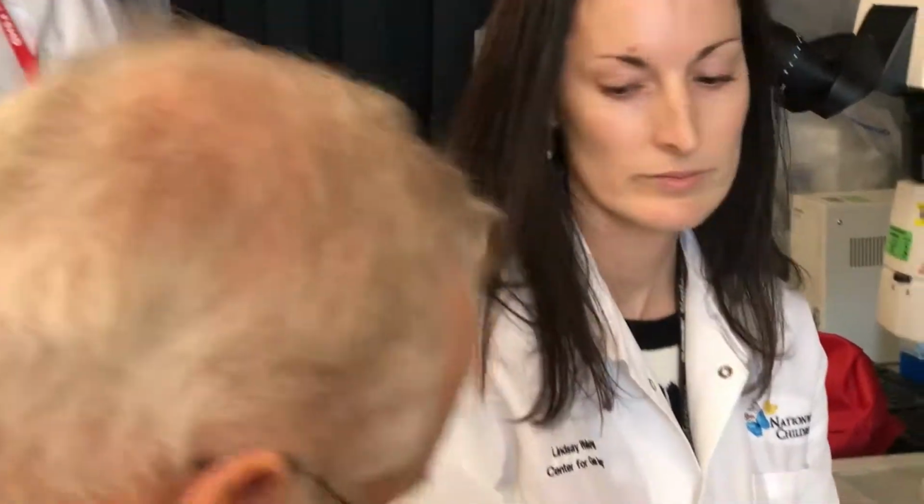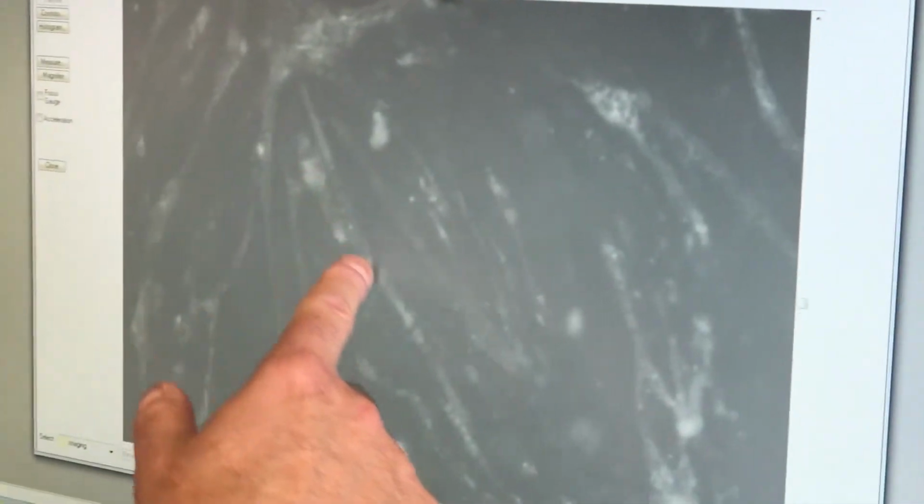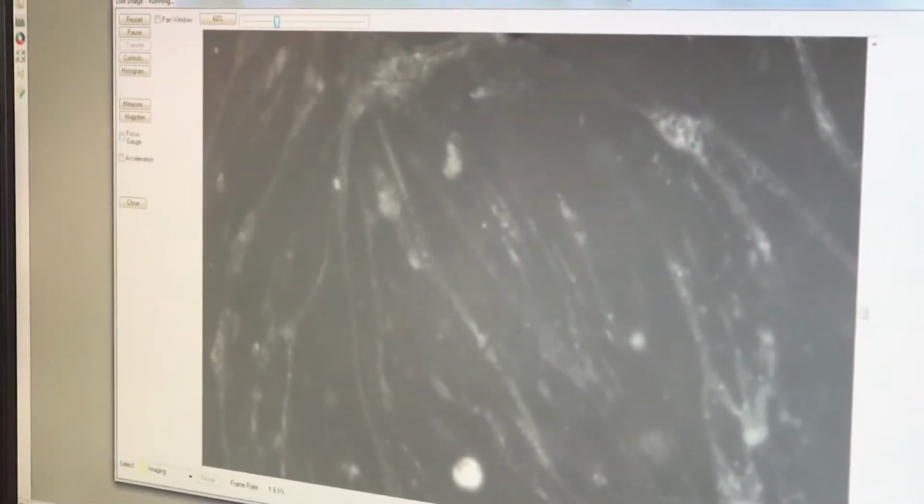And if I may ask, if you're looking at DUX4 production or induced, what have you, can you see whether these disintegrate, or they don't form at all, or you're not looking at it that way?